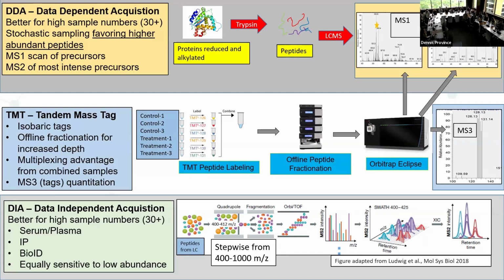And then we use that tribrid mass spectrometer that we just showed you the guts for, and we get an MS1 signal, an MS2 signal, but then we take some of those fragments, collect them, hit them with higher energy, knock off those tags, and we measure the MS3 signal. Whoa. And the height there gives you the quantitation.